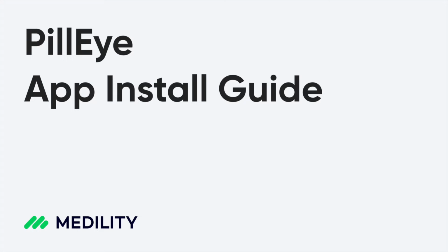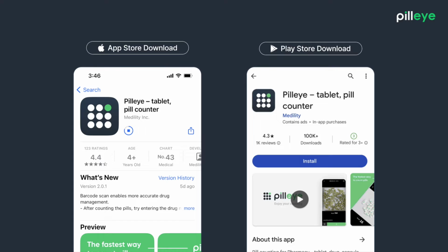Welcome to PillEye, Medility's premier pill counting app. With an accuracy of 99.99%, PillEye enhances your productivity in pill counting and pill-type medication inventory management. PillEye is available for free download on both smartphones and tablets, supporting both iOS and Android platforms.